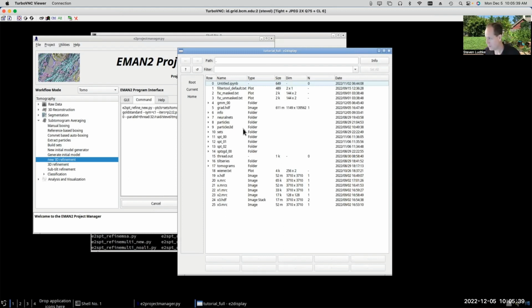As you can tell from this, the resolution is just going to be limited by the quality of the data that you've got. We have done a couple of test cases where we've achieved better than 5 angstrom resolution when the data was really good. This data is pretty good. Very often you'll find when people are collecting their tomography data, they're using way too high total dose. And while you can still make use of the data, if you want to start pushing the resolution at all, that means that you're going to have to strongly restrict which tilts you use when you do the 3D reconstruction. Otherwise, you're going to be using heavily radiation damaged images.